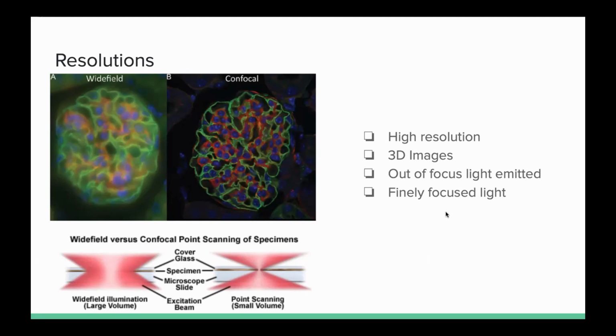A wide-field microscope essentially collects the same data, but it does not collect only the finely focused light, it rather collects all of the light. Taking a look at the bottom, we can see, compared to the confocal microscope, where the light travels through the pinhole, that the wide-field microscope just collects all of the light, which means it collects the out-of-focus light as well, unlike the confocal microscope, which only collects the in-focus light. Looking above that, we can compare the two.